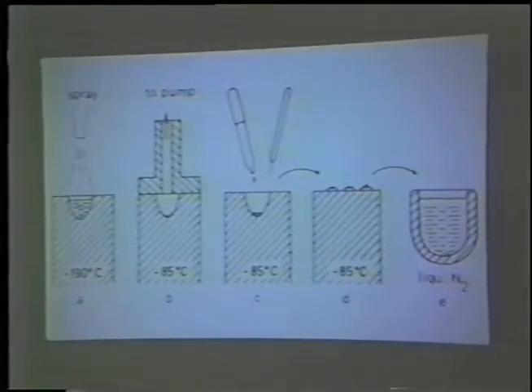We have one of these machines in Andrew Stalen's lab, but it hasn't been used for years. Tried it for a year. It was unsuitable for most of the samples that we used, so we now use a controlled temperature block to do freeze substitution. Well, you were doing single cells, weren't you? Yes. And it didn't work well. No, because of all those problems. Damage to the cells. If the cells survived, very few cells to be seen, etc. It was just too frustrating. It really wasn't worth it. So we went on to develop the propane jet freezer.